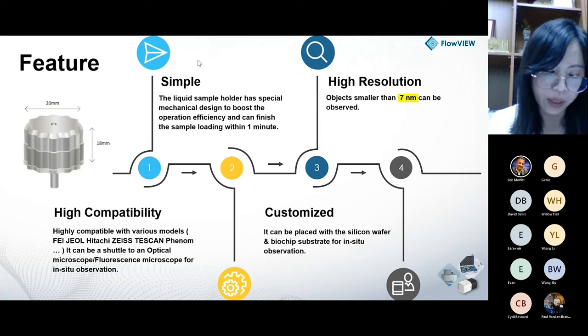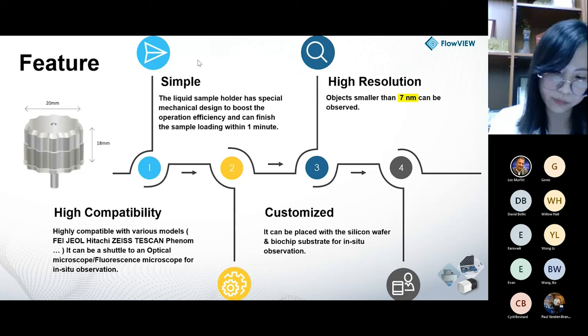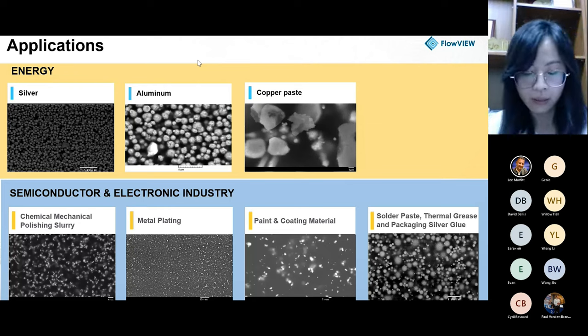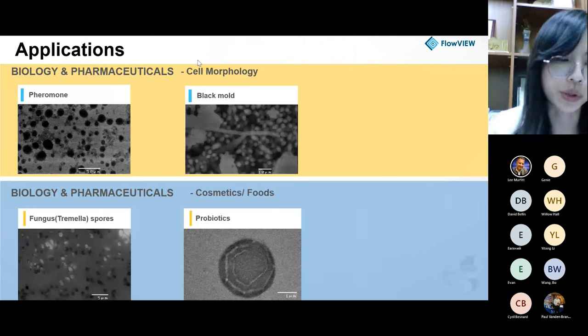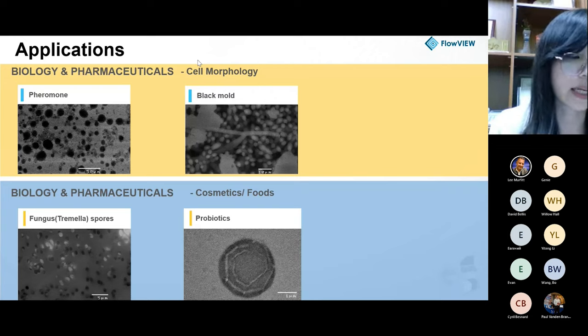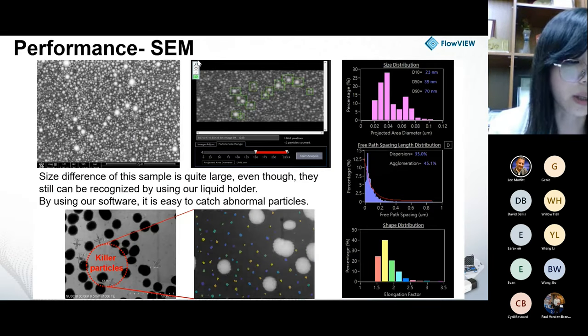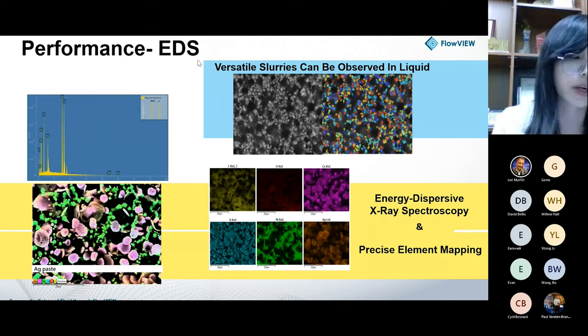Our particle resolution is down to seven nanometers and we have customers from national R&D centers studying advanced materials using this kit in semiconductor, battery, and chemical manufacturing industries. We have imaged battery materials like silver, aluminum, and copper paste, and in the semiconductor field we've done many slurries like CMP slurry, metal plating, and packaging glue. Our product can also be used in biological and pharma industries to analyze black mold and pheromones. You can see the image performance under SEM — measuring particle size and morphology — and observe particle dispersion and agglomeration. You can also use EDX to analyze particle compositions.